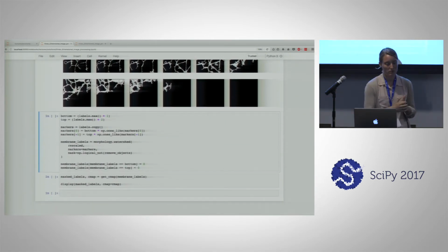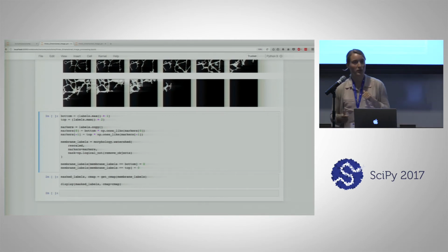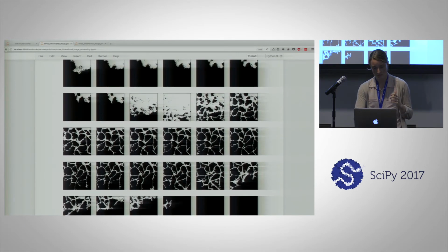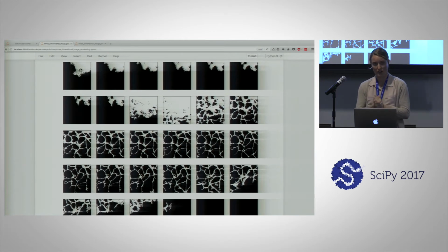So as I mentioned before, there should be one nucleus per membrane, so we'll use the nuclei image that we cleaned up in the previous example to work as the seeds for the segmentation. We don't want to use the membrane as seeds, since the membrane doesn't close evenly, as we see here, so the cells will bleed through further than the membrane actually was.